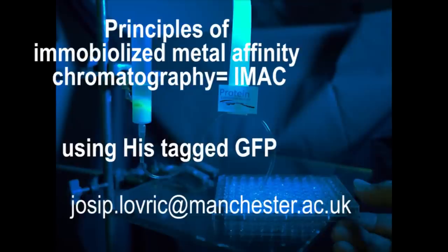To demonstrate to you how affinity chromatography works, Claire and Ed have cloned a His tag in front of a GFP protein so we can actually follow the whole process in this little movie. But first, let's see a time lapse of one of these IMAC separations. Follow the green fluorescent protein and try to figure out what is happening in each step of this separation.